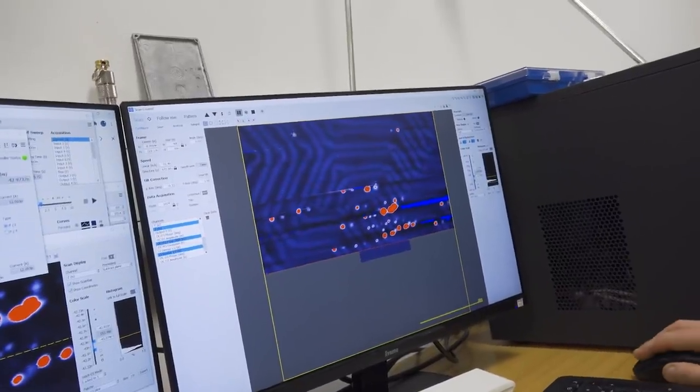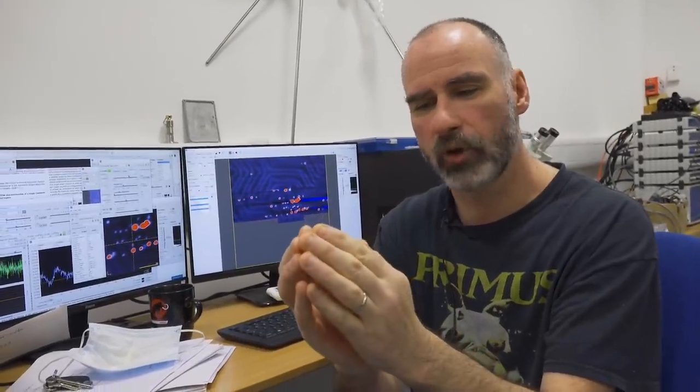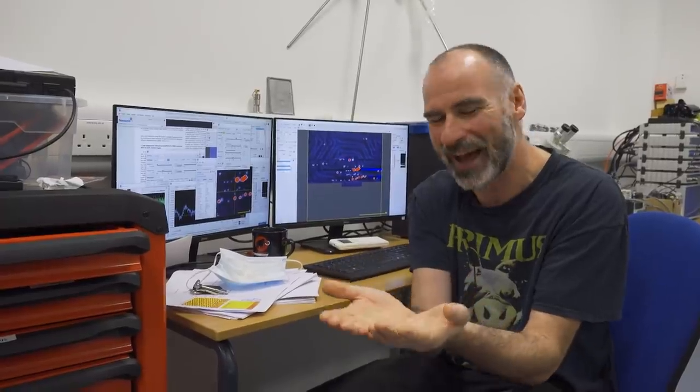So these lines in the background, well, imagine taking a crystal, in this case it's gold, but it could be pretty much any crystal. And you slice that open to expose a surface. Now the atoms that are at that surface are much less happy than they were when they were in the bulk, because when they were in the bulk, they interacted with their neighbors, they have a certain valence, they want that valence, they have a certain number of bonds they want to form. But when you hack through the crystal to expose that surface, not always hacking through, sometimes it's a little bit more nuanced and careful than that, but when you expose that surface, those atoms at the surface are in a different state than the atoms in the bulk. They're much more reactive, their energy's higher.